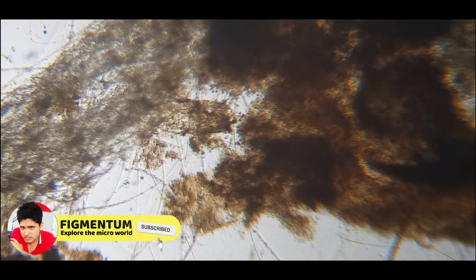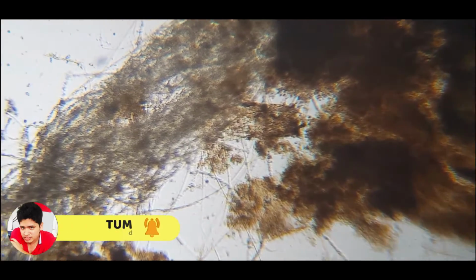Now we will test with the seawater. As you can see, so many bacteria moving around.